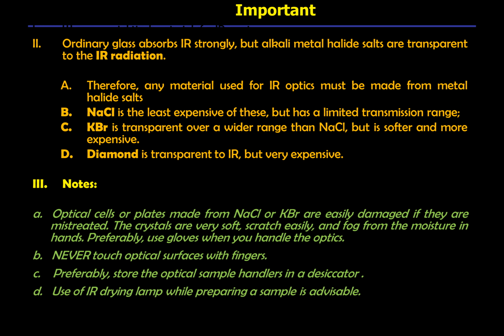Use of an IR drying lamp while preparing a sample is very advisable. When you are preparing a sample and you're going to run a spectrum, you operate under the direct light of an IR drying lamp, which is very advisable.